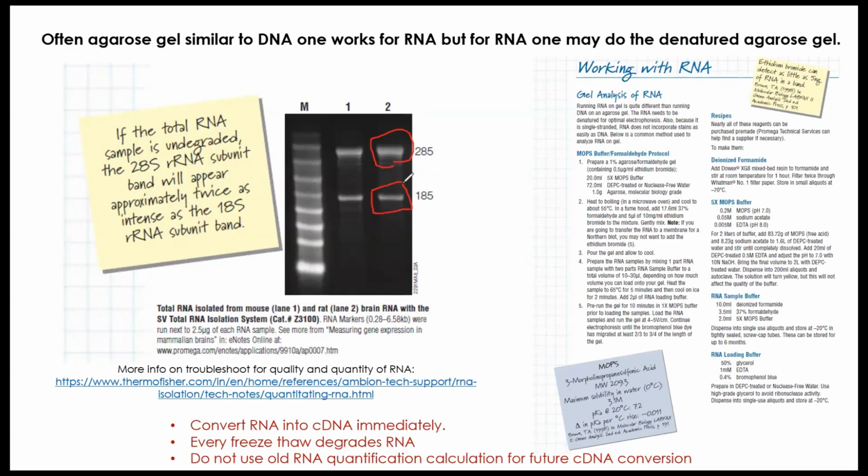If it is not so, then you can say that the RNA was degraded while doing the extraction. If it is even equal, or let's say 18S is thicker than 28S, then the RNA is degraded, right? If it is for one or two individual genes, it may not impact your gene expression much. But if it is for RNA-seq, then that will cause a problem in the downstream processing, right?